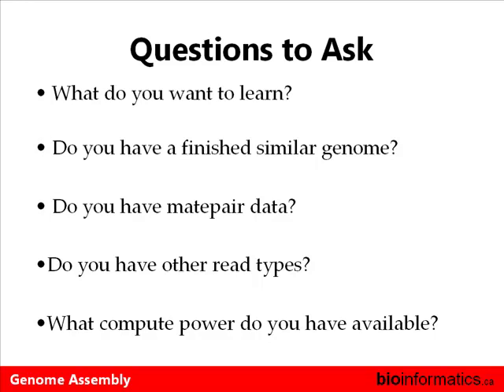For example, in the case of Illumina, or Solexa, I'll use Solexa because I can't remember to say Illumina every single time. In the case of Illumina, I think they do not support mate pair data, and Francis can tell me if I'm wrong, but I'm pretty sure they only do paired-end. In the case of SOLiD, they actually only do mate pairs. They do not support reading two reads some distance apart from each other. And this is basically the difference in chemistry. So it's more what your technology can give you. Although I've heard rumors that SOLiD will soon come out with a paired-end strategy. I don't know if Solexa is coming out with a mate pair strategy. We can ask him about the SOLiD. I'm pretty sure, I've heard this from multiple people, so it's probably true.